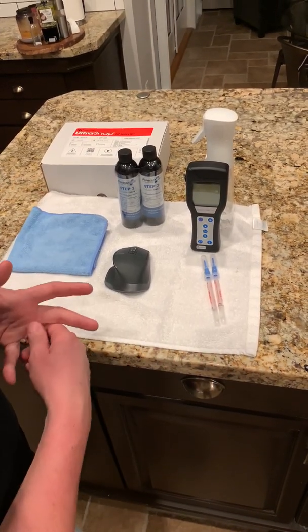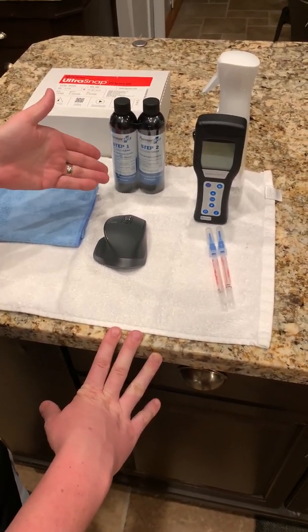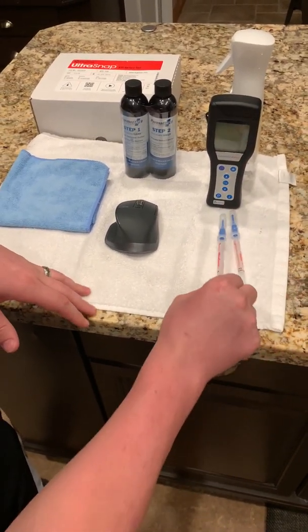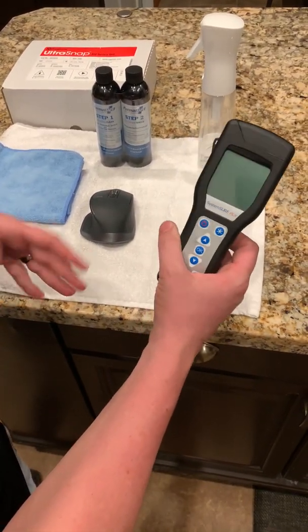This is going to be a quick ATP test of a before and after ATP reading off of a computer mouse. We're going to use Permasafe Step 1 to do a disinfection of the surface. We're going to measure before and after using these ultra snap swabs from Hygenia and an ATP luminometer to do the measurement.